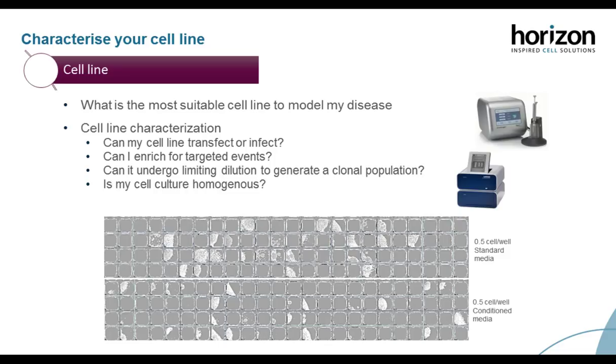So it's just about knowing throughout your procedure that you're not selecting for one of these different phenotypes or genotypes within your cell lines, because you want to be capturing the whole population, and then finding out later on that because you've captured those different phenotypes in your cells, that has no effect on the gene that you're knocking out or modifying.